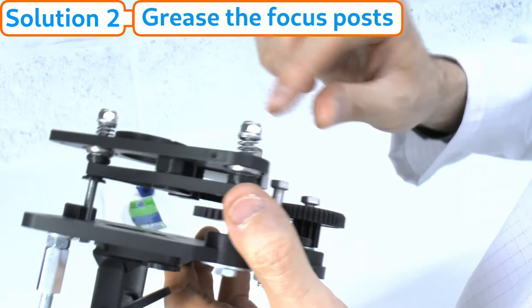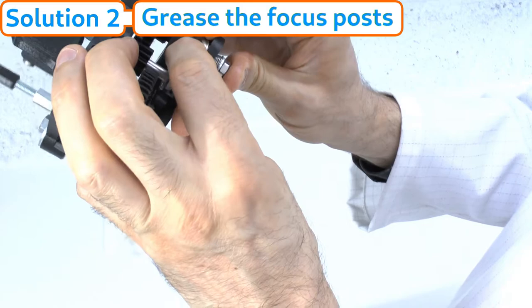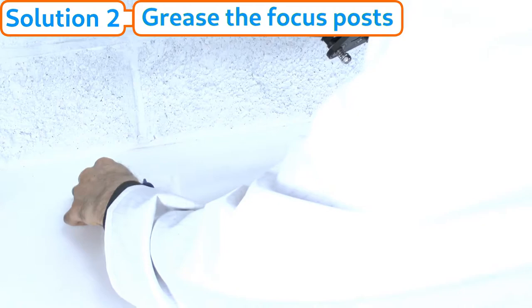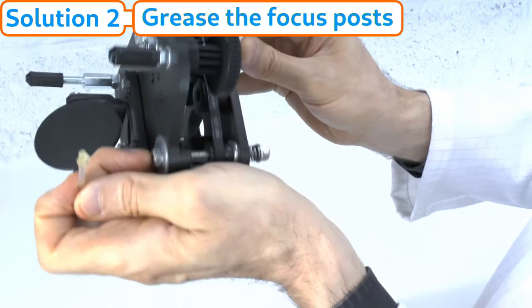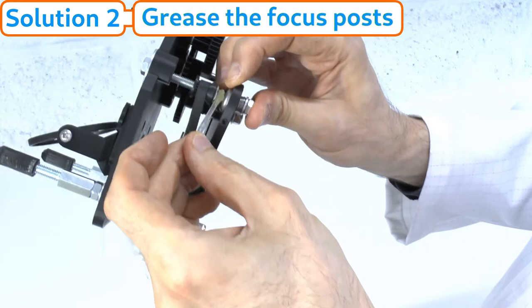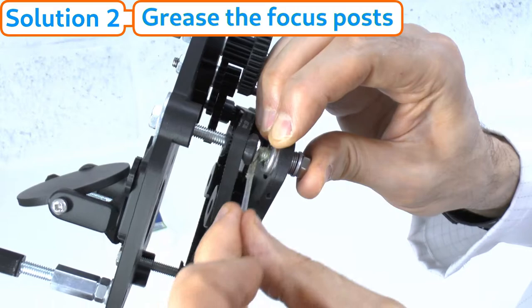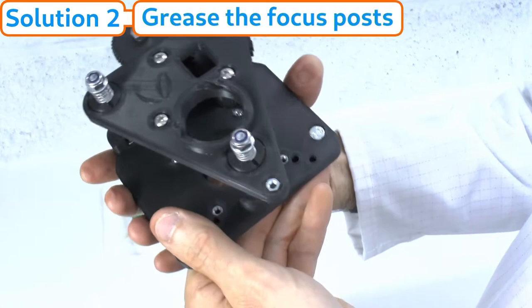Repeat for each of the three focus springs. When you've done it for each — put some grease around, make sure it's central, then go to the next one, again some grease in there, release it, make sure it's central — so those are all nicely greased and central.